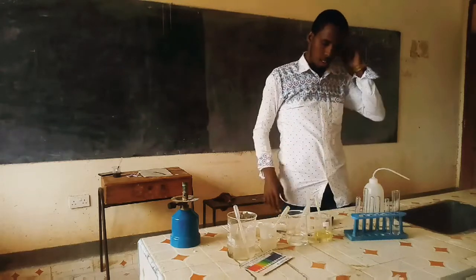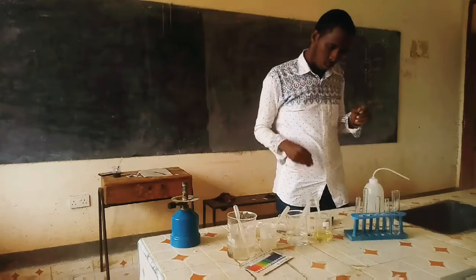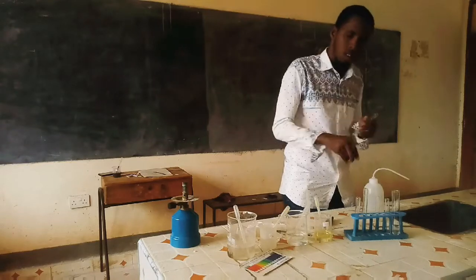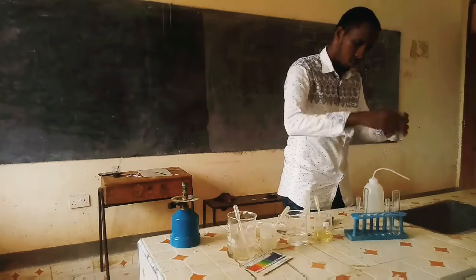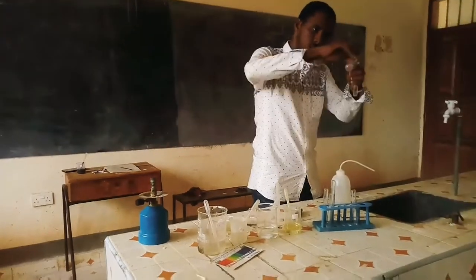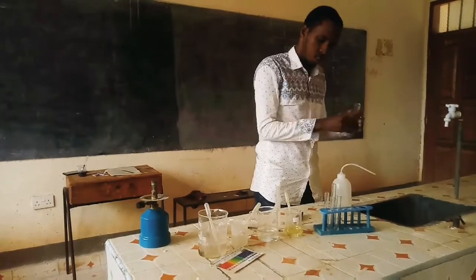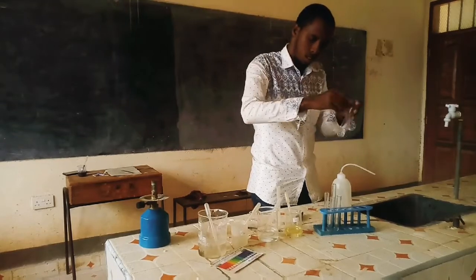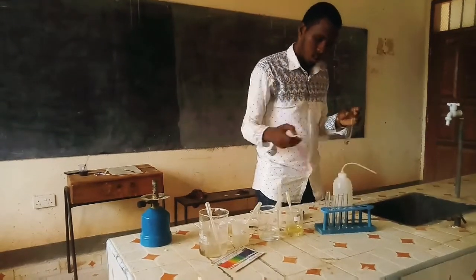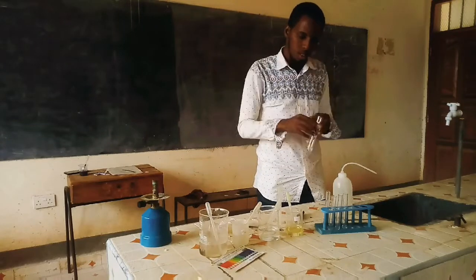Now you divide that solution into 4 portions. Let us divide into 4 portions. That's the first portion. That's good. That's the second portion. And that is the third portion. And that's the fourth portion.